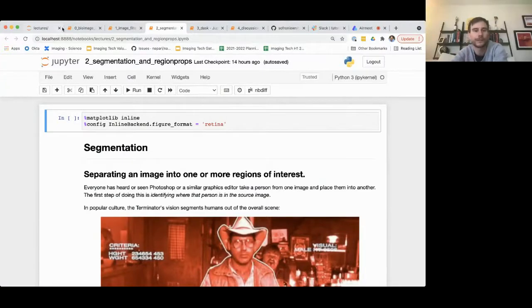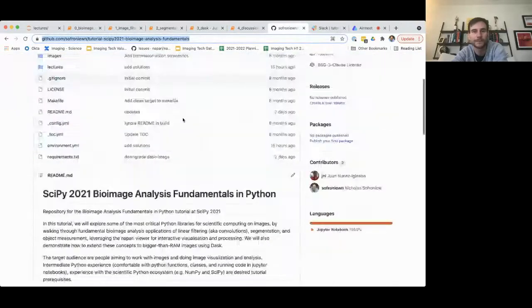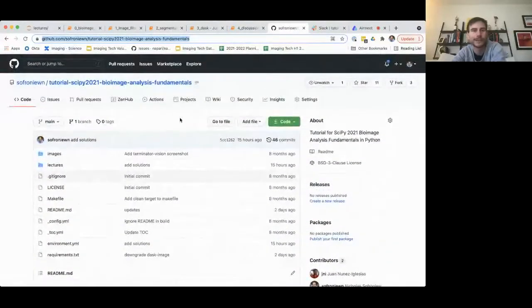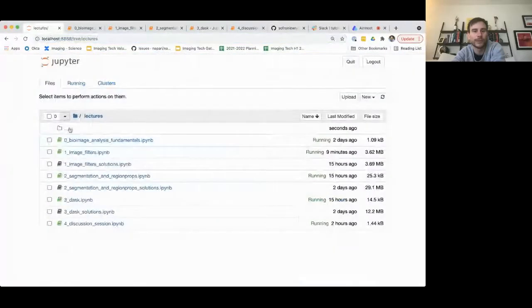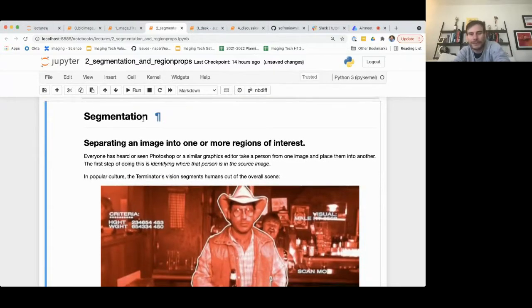And again, just a reminder for folks that are joining, this is the tutorials repository. Kira will be placing it in the chat as needed. We've got all the lectures here, and there are copies with solutions and without solutions. If you want a more interactive experience, you can go with the versions without solutions. If you just want to follow along, you can look at the ones with solutions too. I'm again going to do a little bit of configuring my notebook, matplotlib. And let's talk about segmentation.